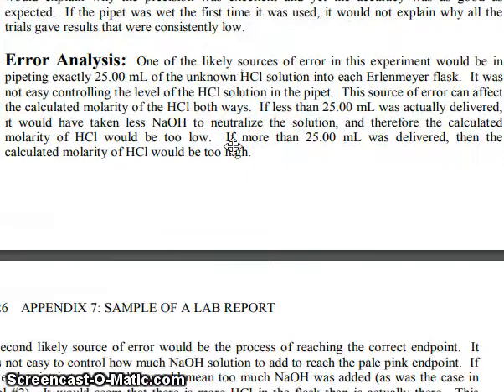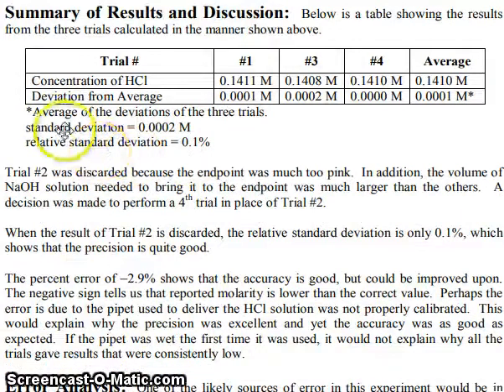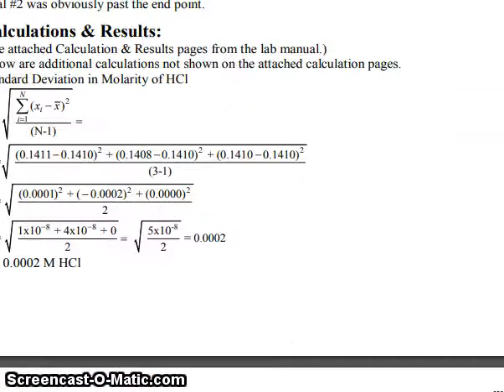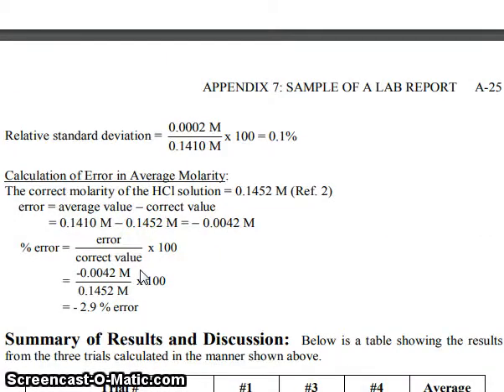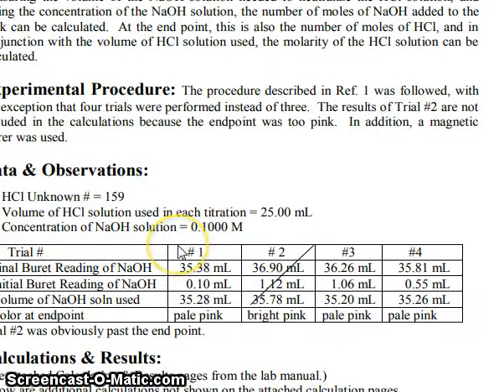So friends, you just write in your notebook like that. Standard deviation you have to calculate this one. If you see this formula, sigma is equal to this, so whatever value is coming, you just put it there and then you calculate the standard deviation if you need. But the only important things you have to write are your two volumes and one molarity. You already know, you have to calculate the molarity of the second. Then you have to calculate the strength. If you know the molarity of this unknown HCl, just multiply it with the molecular weight, then you will get the strength of hydrochloric acid.